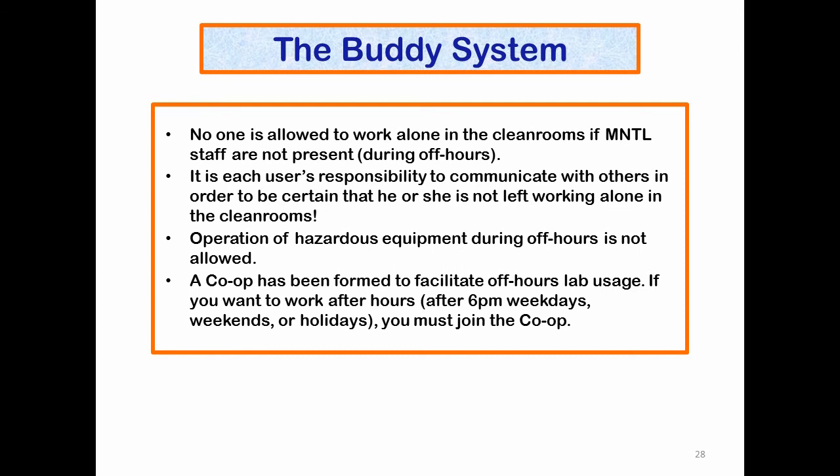We do have 2 systems to ensure that users in the clean room have people to act as buddies. No one is allowed to work alone in the clean room if MNTL staff is not present during off hours. It is each user's responsibility to communicate with others in order to be certain that he or she is not left working alone. You are required to have someone in the clean room with you at all times.